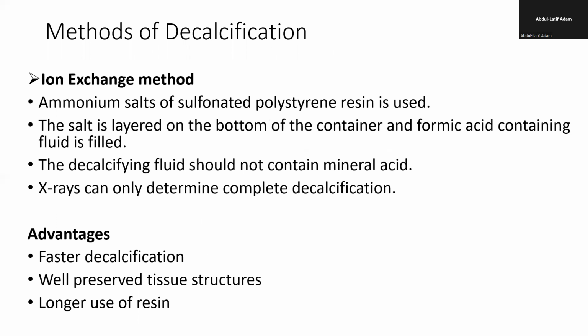Another method of decalcification is the ion exchange method. Just like you do electrophoresis. So ion exchange means that there is exchange of ions. Usually you use ammonium salt. The ammonium will be changed with the calcium because they are both positive. So it can be changed with the calcium, removing the calcium and replacing it with the ammonium. Okay, it has advantages.